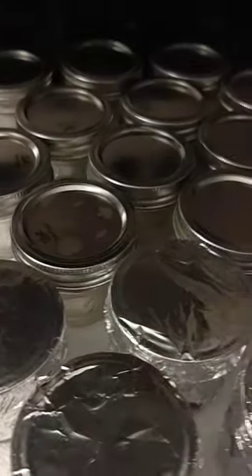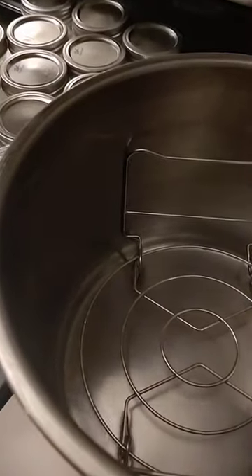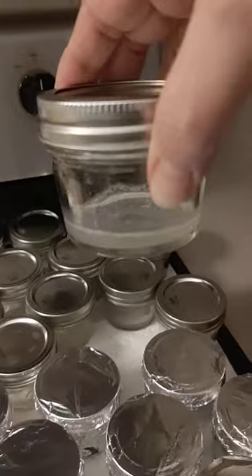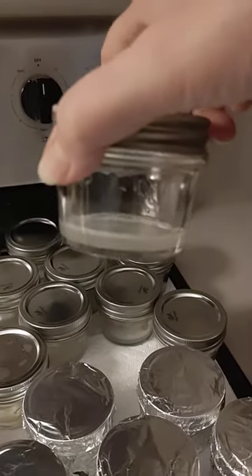So now we pressure cook for 20 minutes, and this time we should have less condensation because we let it cool a little bit before we put our tops on.